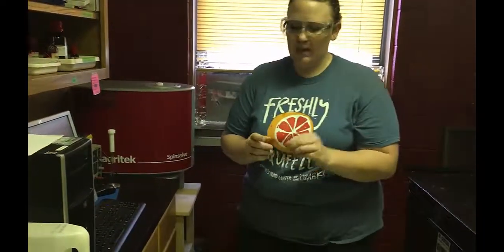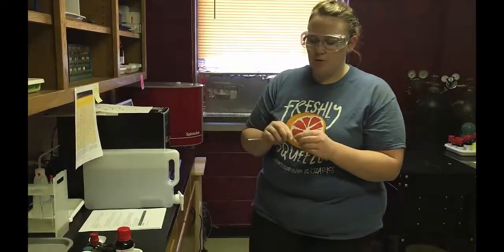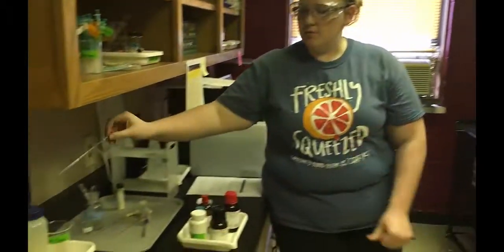Put that back, and now your sample, since it has chloroform in it, it has chlorine in it. So it is a halogenated waste now. So we'll take it into the organic lab, dispose of the liquid in the organic halogenated waste, and you can put your old used NMR tubes right here in the beaker.